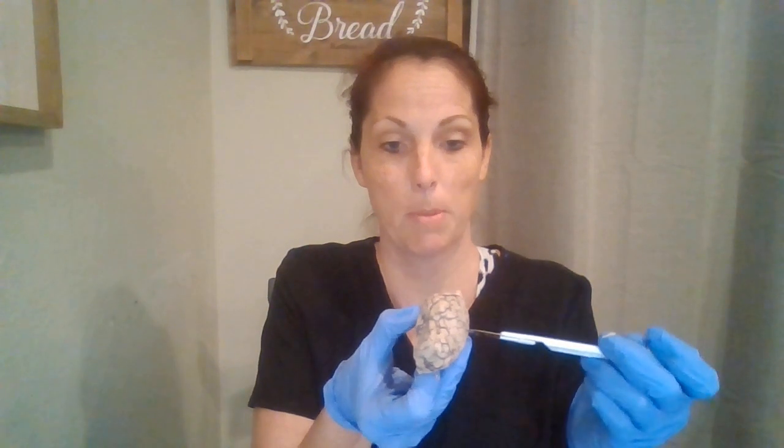So I just need to look and see what I have missed. The corpus callosum, we already went over that. It's that Nike check sign there. Oh, so I need to do the coronal cut, which is going to be the cut that separates the front from the back, so we can look at the hippocampus. So I am going to make a coronal cut. We have the half of the brain, and we're going to make a coronal cut that's going to separate the front from the back.